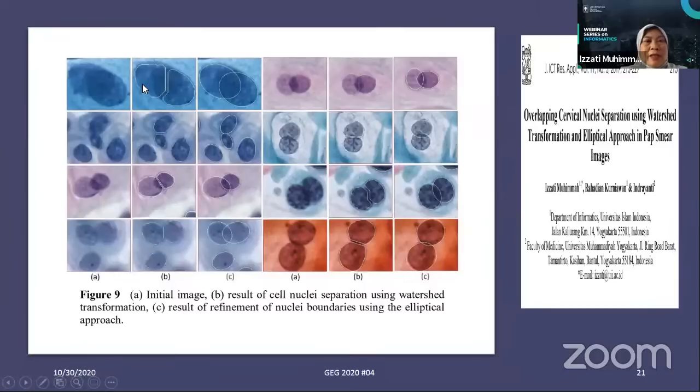If you see that in the watershed there are two centroids, and then they will attract the data. But if we check, the borders are not elliptical, as the concept of nuclei says they should be.